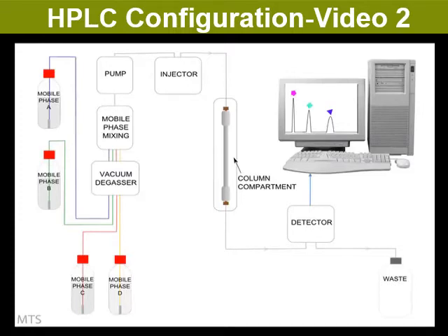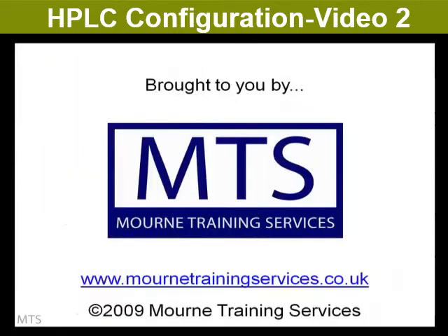Now that we have looked at the individual components of a typical HPLC instrument, you should be able to look at the system that you use in your laboratory and understand how it works.